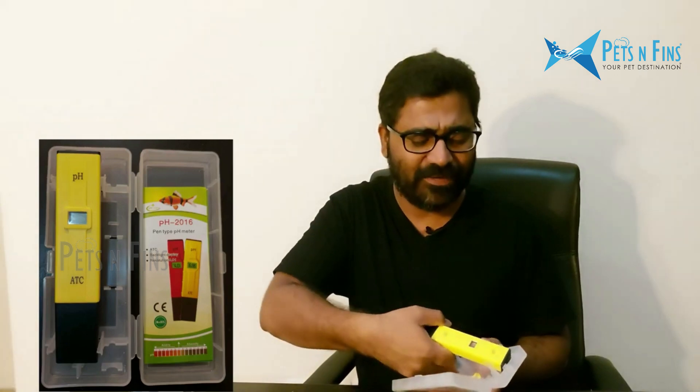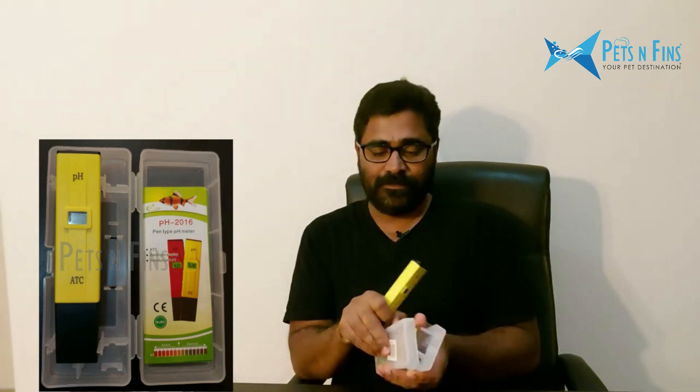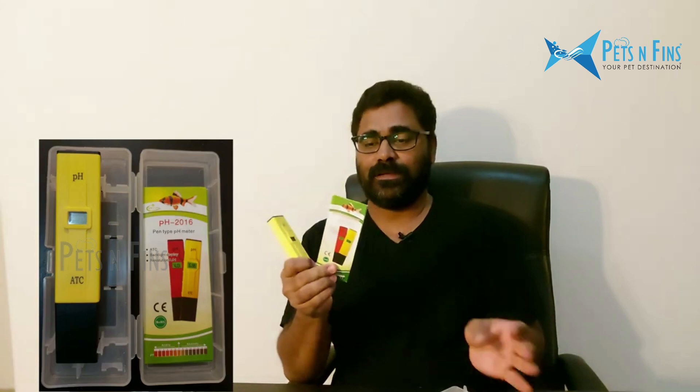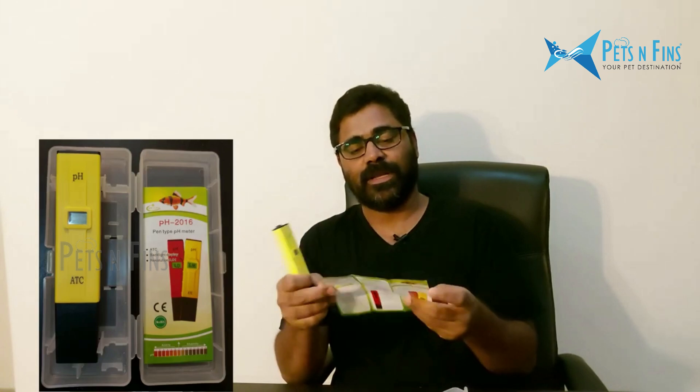Let's take a look at the details of the PHMeter brand. This is a catalog. You can use the PHMeter's buffer solution. If you calibrate it, you can get the correct result.